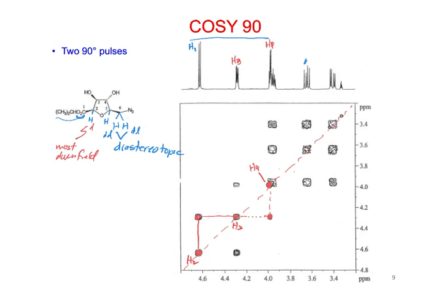So we're a little bit stuck here, but let's start at the other side. We originally talked about H6, and we said that they should be doublets of doublets and be diastereotopic. Where do you think you would see those in this spectrum? Oh, it's 3.6 and 3.4, right? So these two peaks here are going to be H6, and we see that they couple to each other.